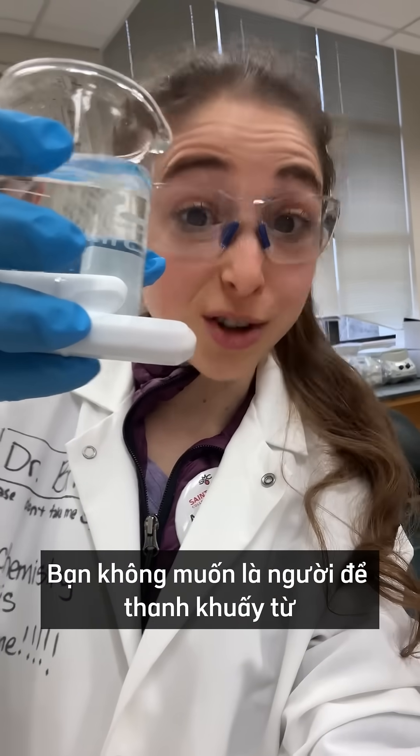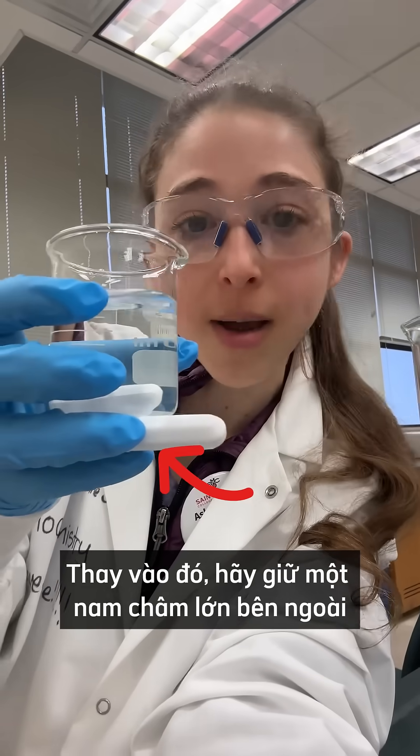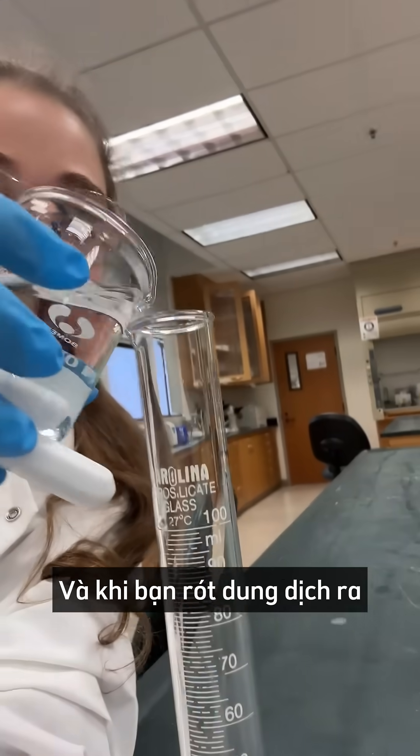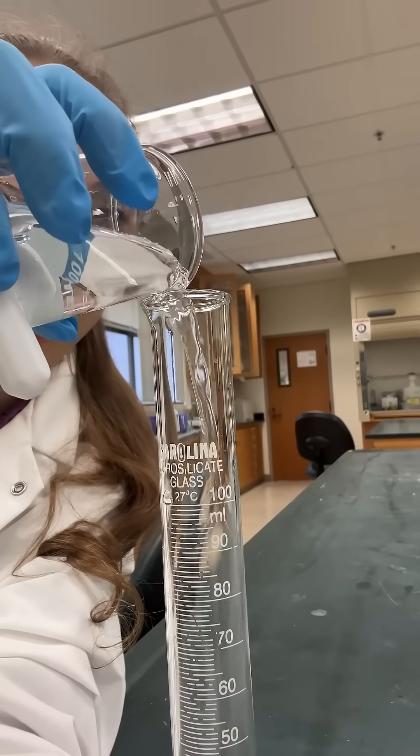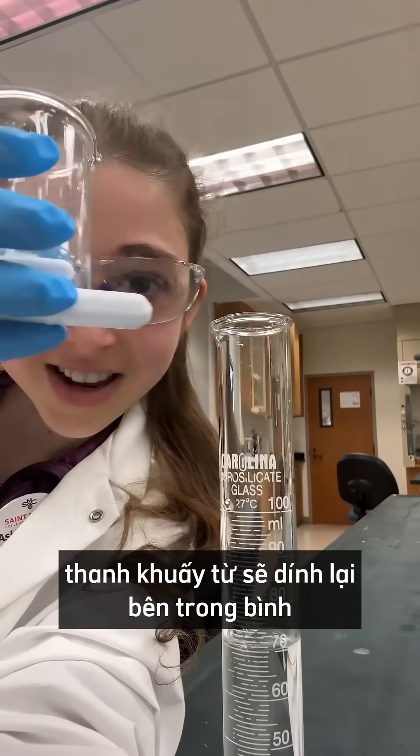You do not want to be that person whose stir bar falls into your graduated cylinder. Instead, hold a bigger magnet on the outside, and now when you transfer your liquid, the stir bar stays in.